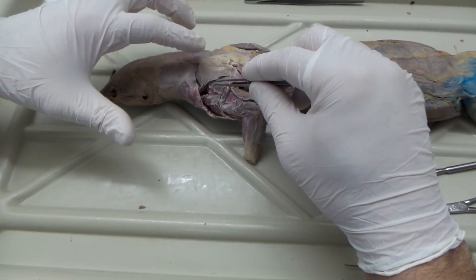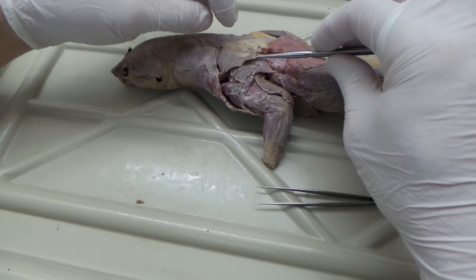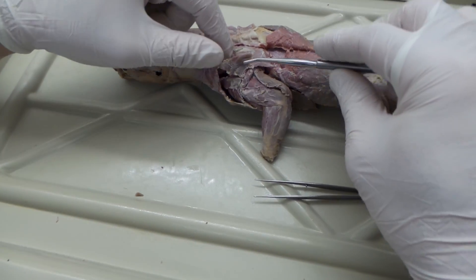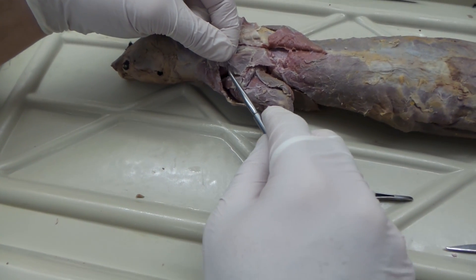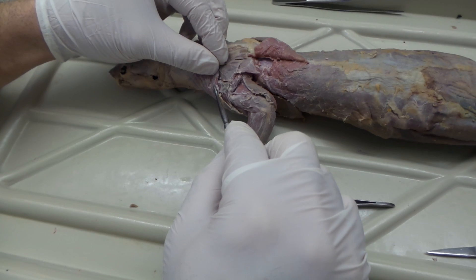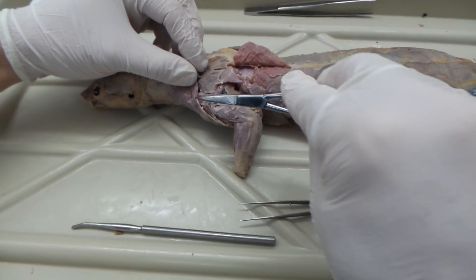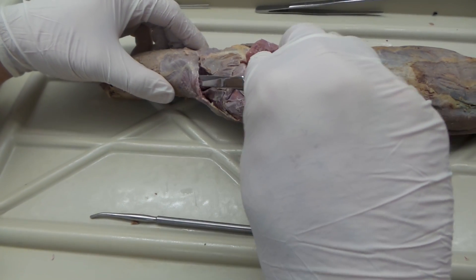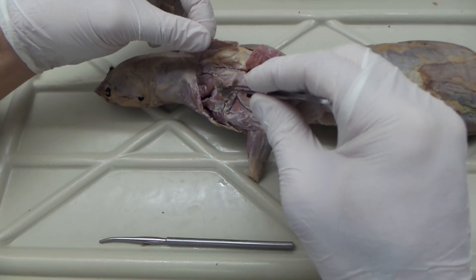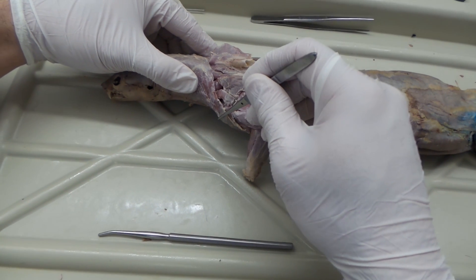You're going to want to work away the fat in here. I came along with my scissors and lifted so I could pull back the spinotrapezius, then lifted to expose the acromiostrapezius. Right at the inferior portion of the acromiostrapezius is a little strap muscle — that's the levator scapulae ventralis. I pulled away the clavotrapezius to clean it up. So again: acromiostrapezius, spinotrapezius, clavotrapezius, levator scapulae ventralis.